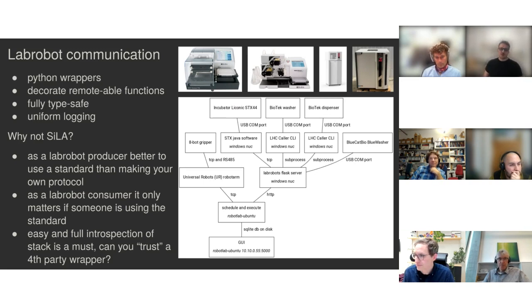But if you are a lab robot producer, say you are Biotek, the company that produces these machines, instead of making up their method for communication, it would be better if they used a standard. Then maybe someone has written a SILA wrapper for one of these.